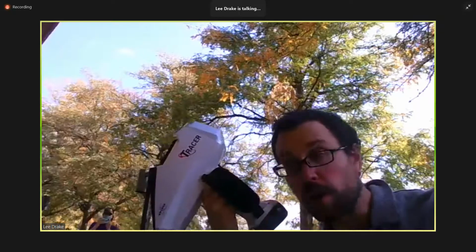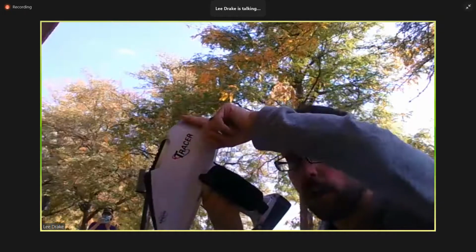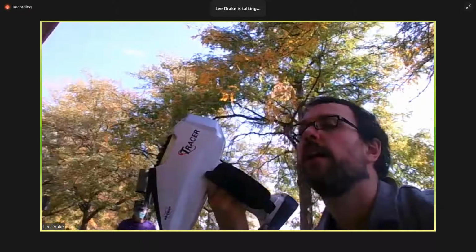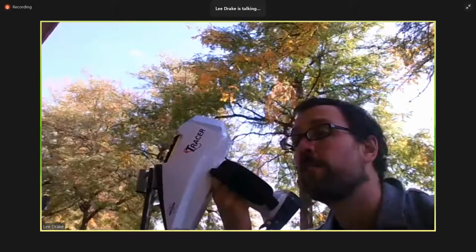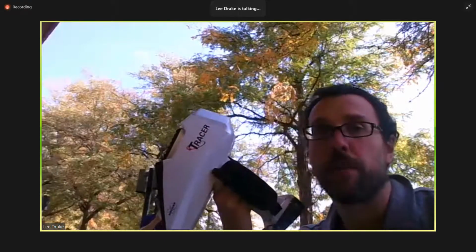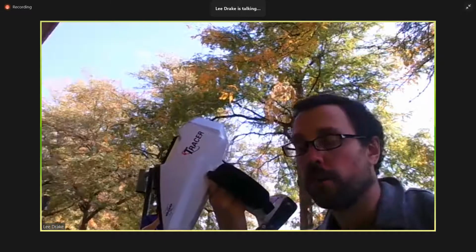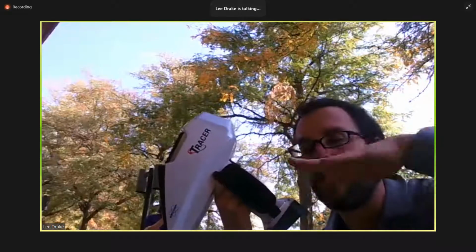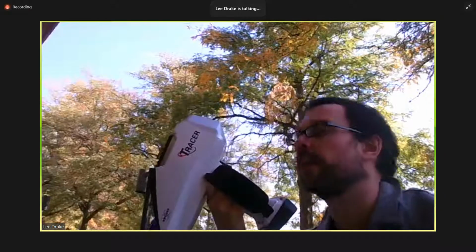Now, if you wanted to get perfect fluorescence, what you'd want is a right angle. You'd want to basically skip the photons like a stone across a lake. That will give you minimal backscatter and lets you see parts per billion level in objects. Bruker, for example, makes equipment like the T-Star and the Picofox that have that 90-degree angle so you can do parts per billion analysis.